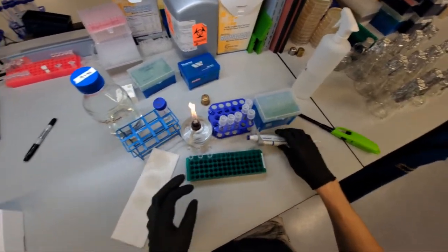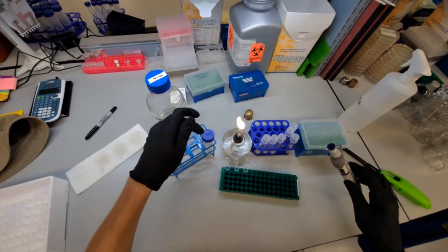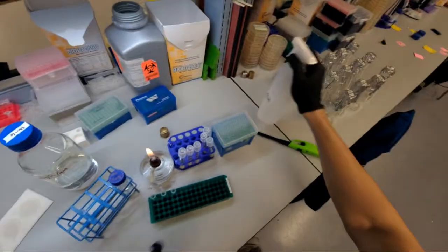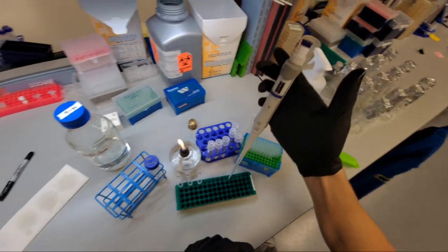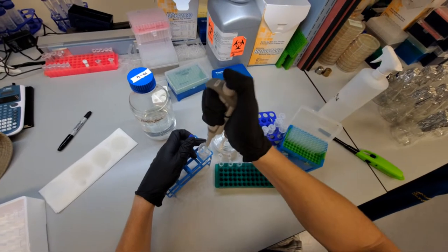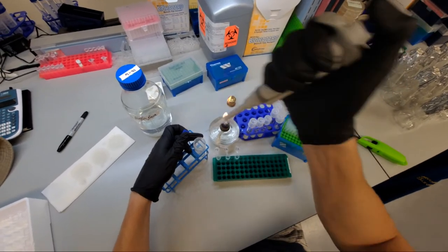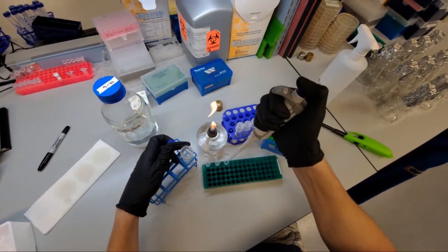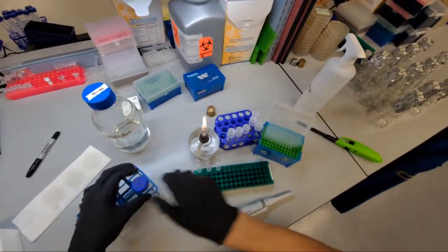And so we're going to be inoculating these cells into this Turkey media. So the first author of the paper, their last name was Turkey. And so we call this media Turkey media. I'm going to be using copious amounts of ethanol to keep things sterile. I'm going to take a tip set to 800 microliters and I'm going to put two aliquots of 800 microliters into each tube. So then each tube should have about 1.6 milliliters of liquid.